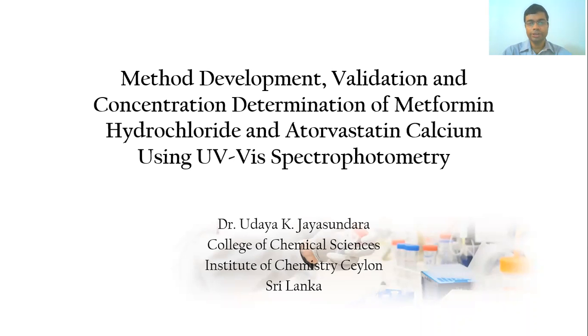Today I am going to discuss one of the most important research areas applicable for the pharmaceutical industry. The topic of my talk is method development, validation, and concentration determination of metformin hydrochloride and atorvastatin calcium using UV-visible spectrophotometry.